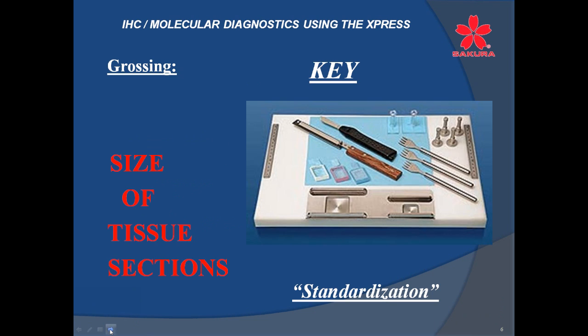So let's look at the first one, which is grossing. And I put here the size of the tissue sections really does matter. And I think that's the first thing we have to look at in validating the process, because we need to have things on a consistent basis as far as the size is concerned.